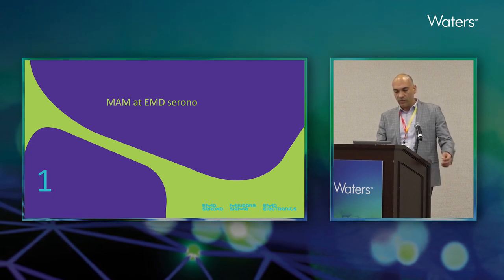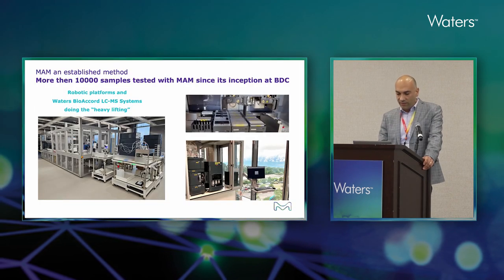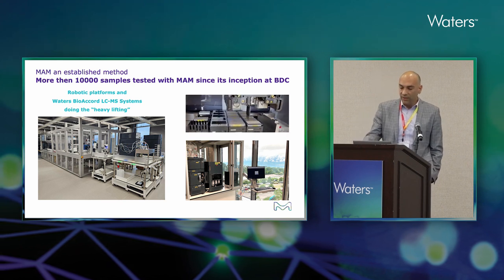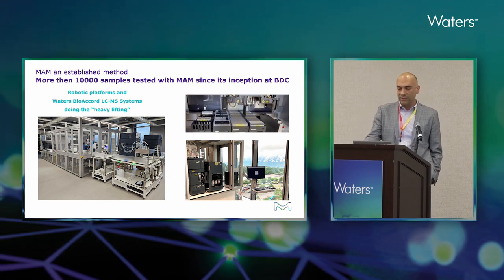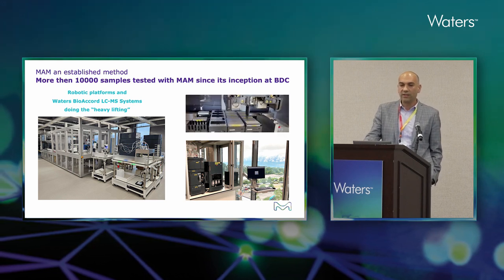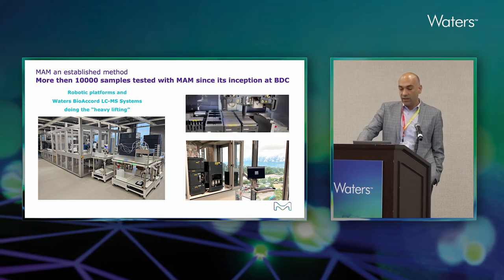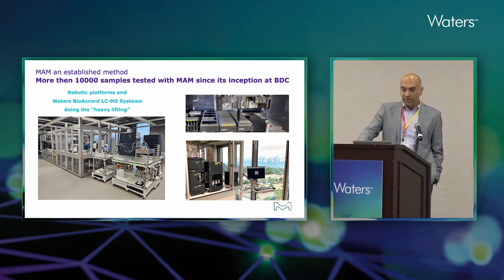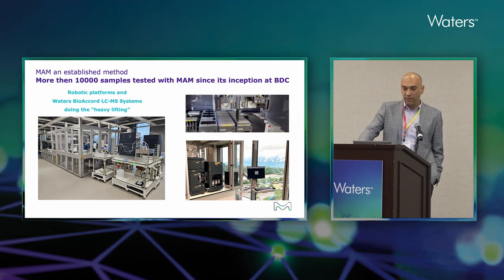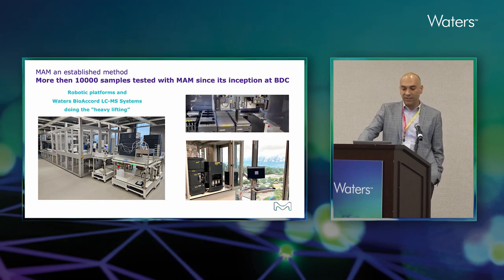I'm going to switch to some experience that we gained with MAM in EMD Serono. Before even triggering a discussion with the regulatory colleagues about how to introduce this testing in the filing of a molecule, it's really important to acquire solid knowledge about how MAM is actually performing in your lab. We did it in Vevey by supporting multiple process developments, and performing a rapid count, I noticed that we recently passed the cap of 10,000 samples tested by MAM.